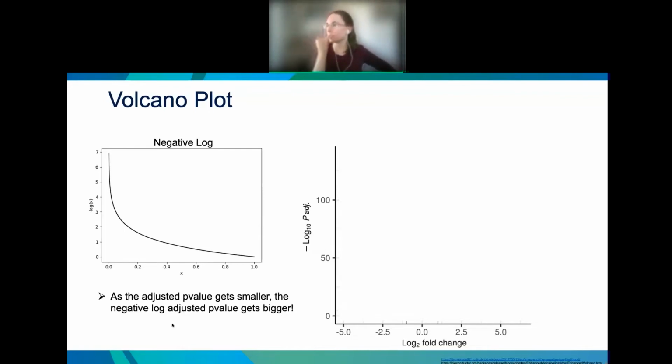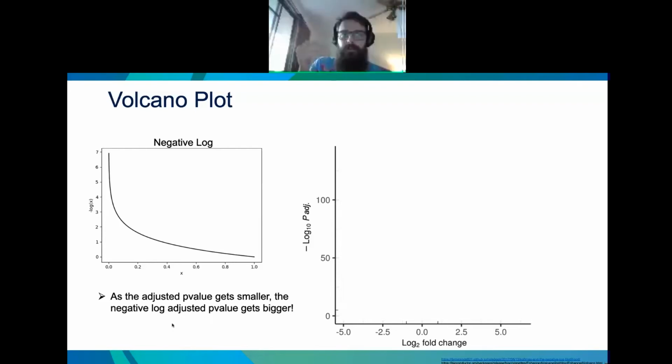Is that in RNA-seq or in proteomics, Joel? Do you perform multiple testing correction for proteomics the same way we do for RNA-seq? Yeah, we do all that. We still just present a raw volcano plot, because otherwise you have the compression and it doesn't actually look like a volcano. It looks like a compressed little winged graph.